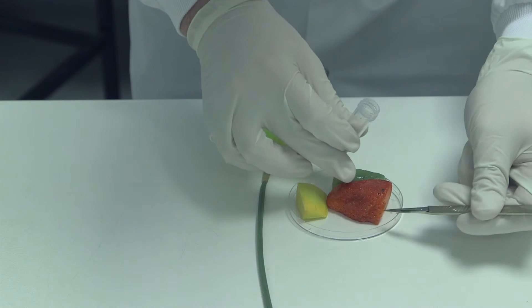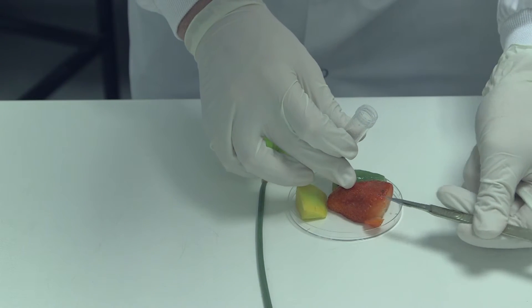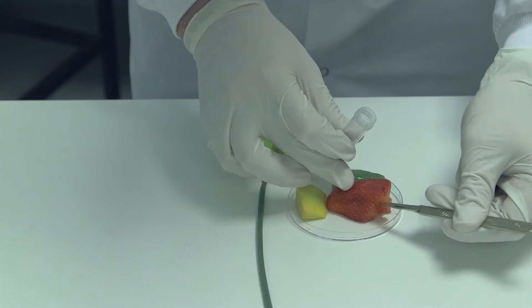Cut a piece of fruit or leaf material and add to the bijou, which contains the extraction buffer and ball berry.